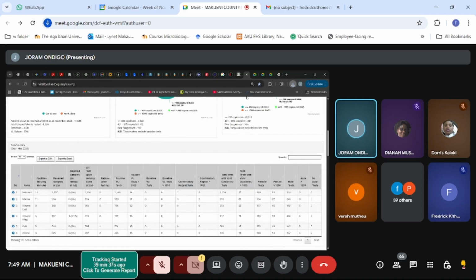So you can see. So this one, you can come and click on it, and then you start processing that data. You can actually now look at that data in an Excel format. As you can see now, I don't know if you're able to see my screen still. Yeah, you can see my screen. So you can actually look at this data in an Excel format, but it is raw data, collated data.